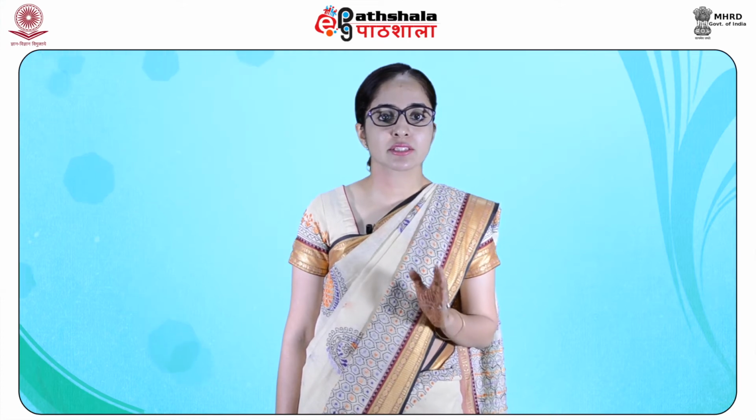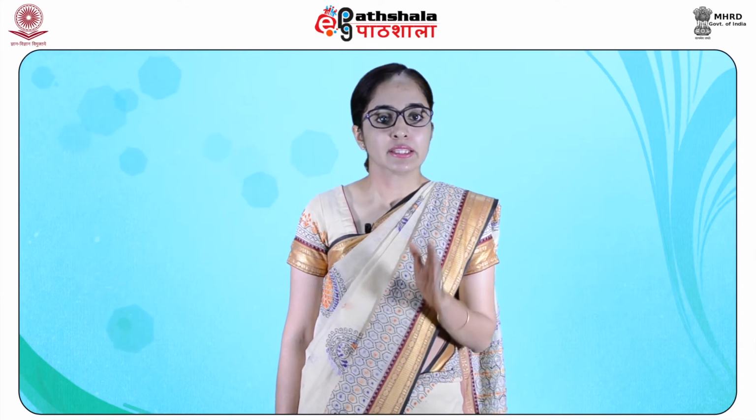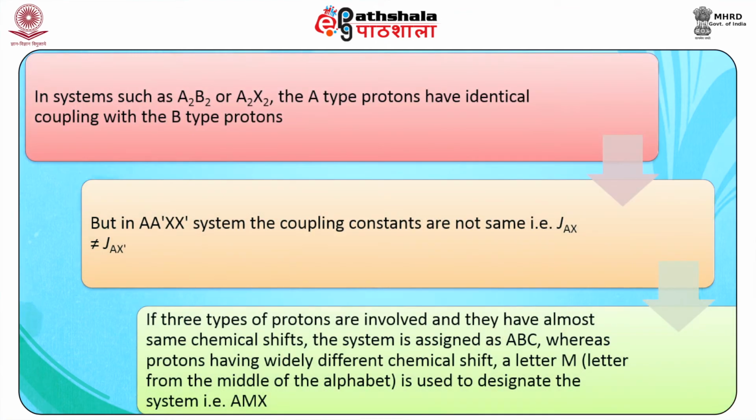If protons have the same chemical shift but are not magnetically equivalent, they are labeled as AA' system. Thus, in systems such as A2B2, A2X2, the A type protons have identical coupling with the B type protons. But in the case of AA', XX', the coupling constants are not the same, that is JAX is not equal to JAX'.